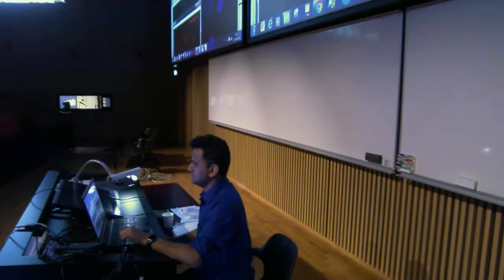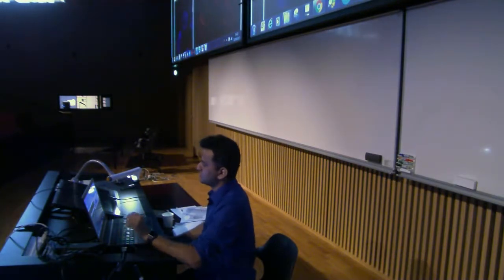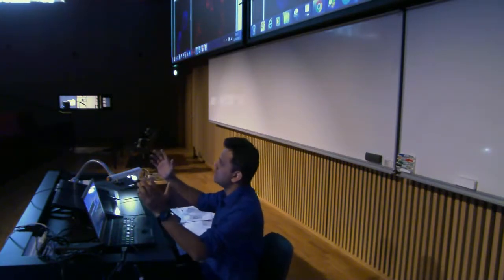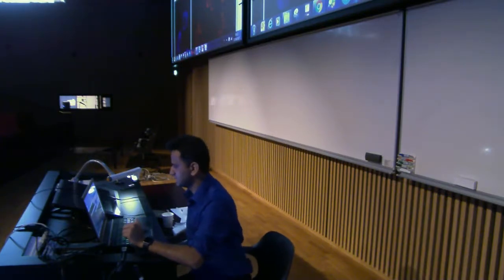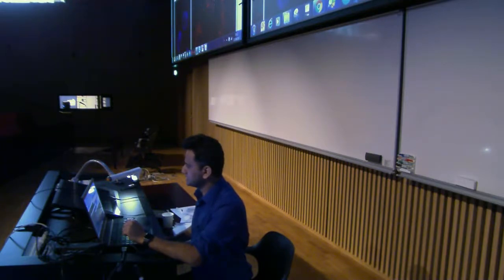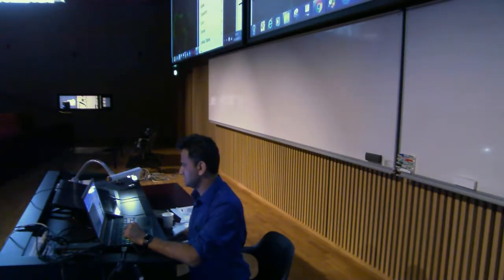Now you have basically 3 images, okay? And now what I want to do is make a montage, so that in the PowerPoint or the publication or journal, you can put it as a montage image with a scale bar, with the different channels that you are actually studying. In order to make a montage, all the images need to be in a stack. Okay, so what is a stack? But before that, I have to convert this into RGB. So go to Image, Type, and make it an RGB image.